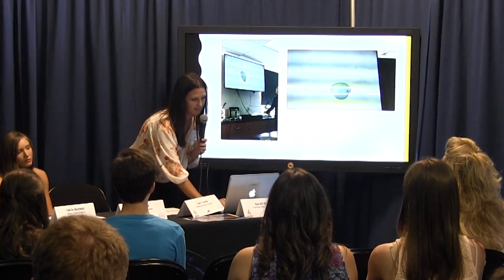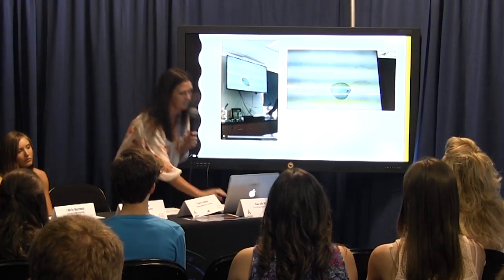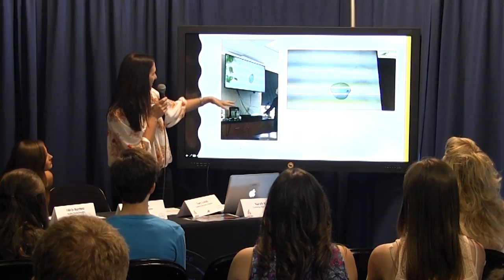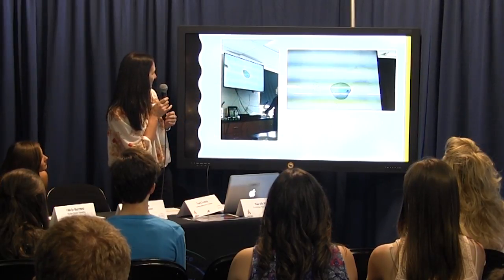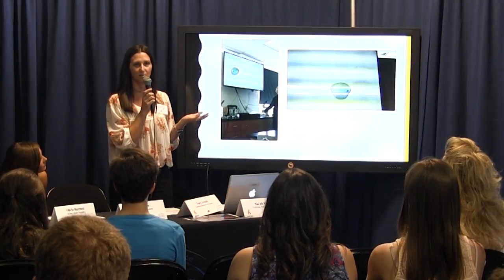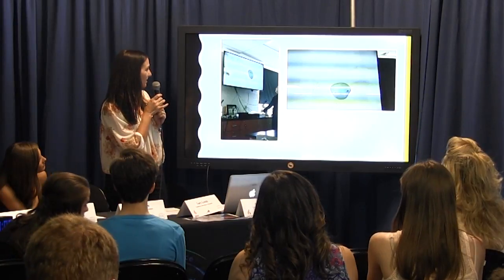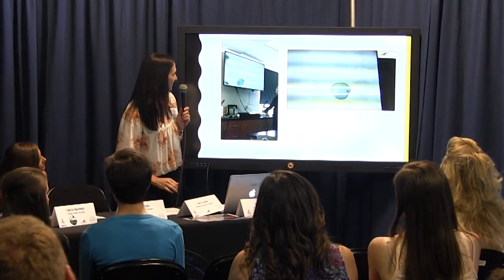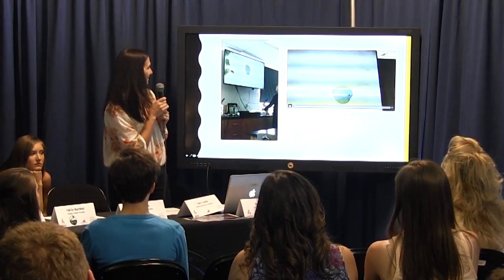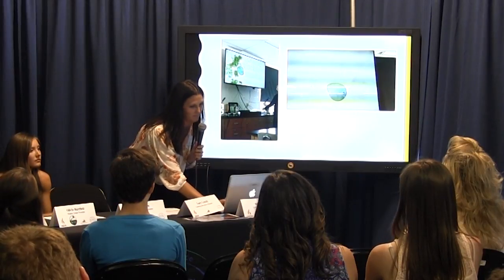And then, let's see what we've got here. This was one where they caught some living organisms. This was Stentor moving around, so you can see it. And he was getting really good at following it around. And these kids had never used a microscope ever. Their teacher did everything for them, so they got to where they were really, really good at it. So let's see if I can. Okay. So you can see, basically, those were the same things.